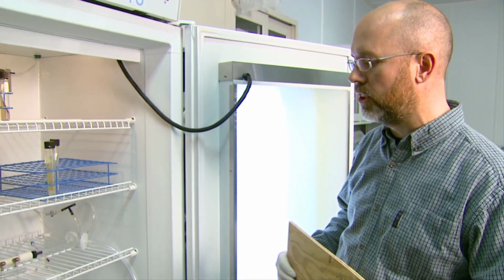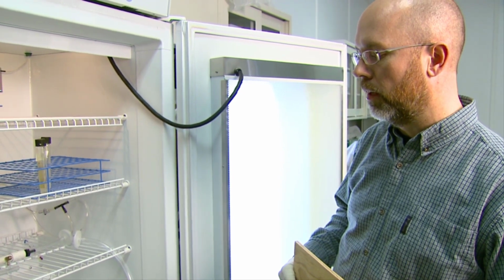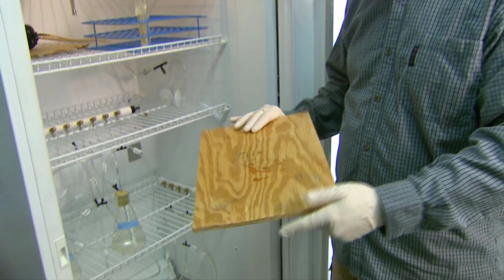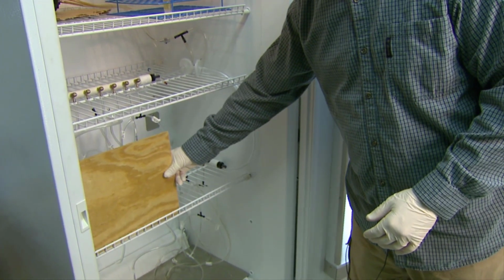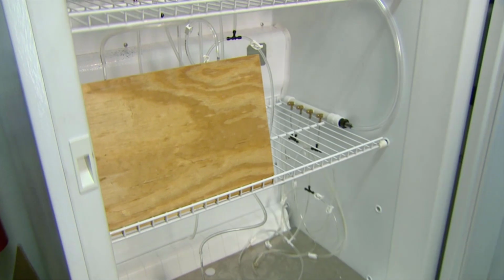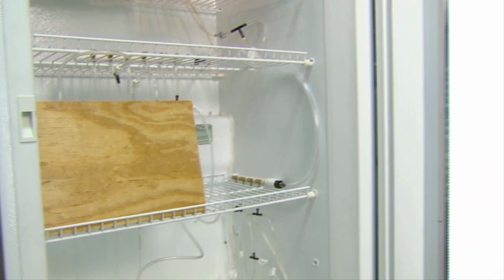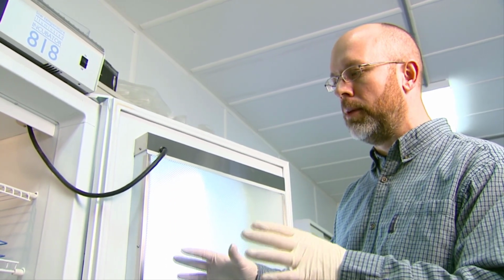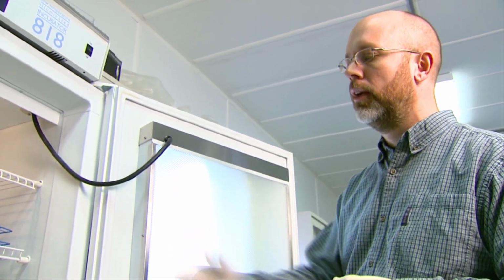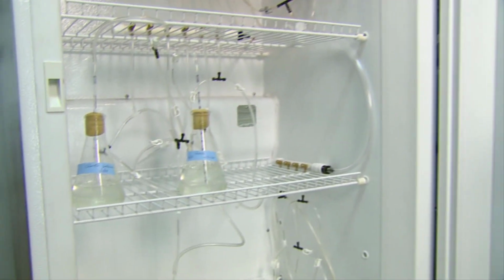So early on in this stage, we recommend indirect light for the cultures. You can take this piece of plywood, or a piece of cardboard, whatever it is, and just set it in front of the cultures temporarily so that the light coming from the front of the incubator is not directly on the algae. It's actually bouncing off the back and hitting the algae. And then when it grows for maybe 3 or 4 days and starts to get some color to it, you can take this piece back off and you're good to go.